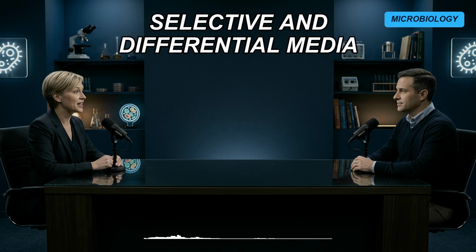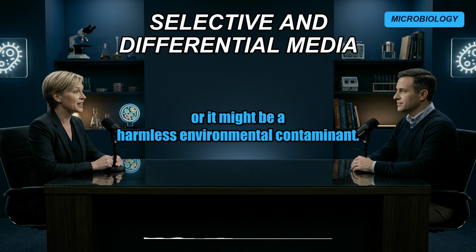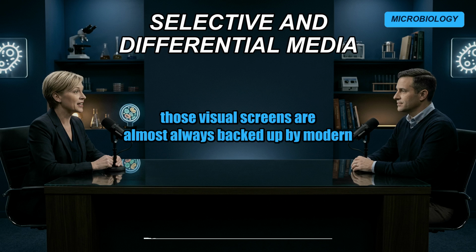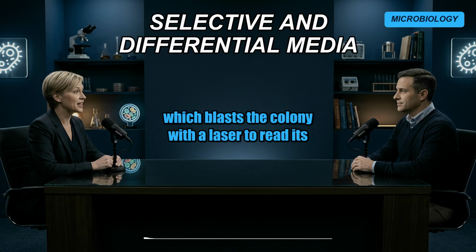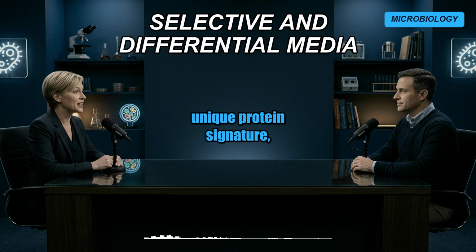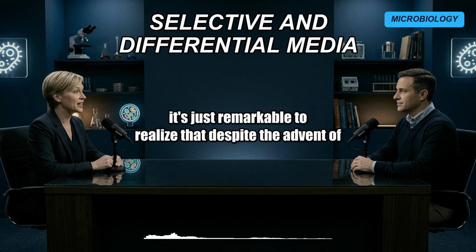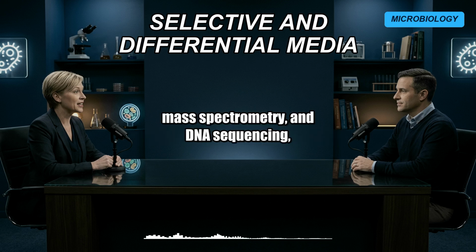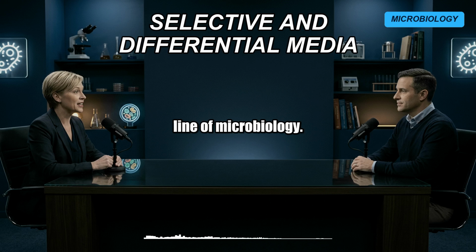Even in a modern hospital, if a technician sees a faint pink smudge on a MacConkey plate, it might be a slow-growing pathogen, or it might be a harmless environmental contaminant. Today, those visual screens are almost always backed up by modern confirmatory technologies like MALDI-TOF mass spectrometry, which blasts the colony with a laser to read its unique protein signature, or PCR, which definitively detects its DNA. Bringing this deep dive to a close, it's just remarkable to realize that despite the advent of lasers, mass spectrometry, and DNA sequencing, these clever century-old agar plates remain the indispensable front line of microbiology.